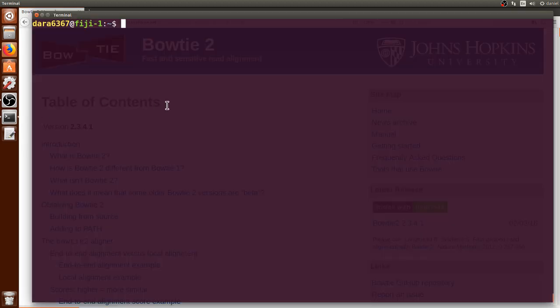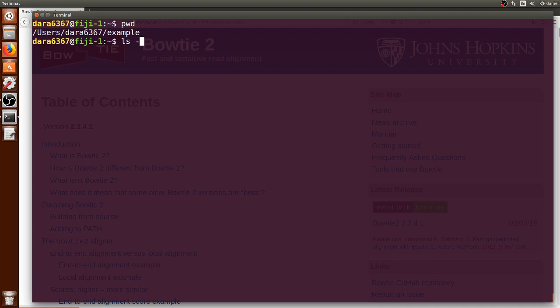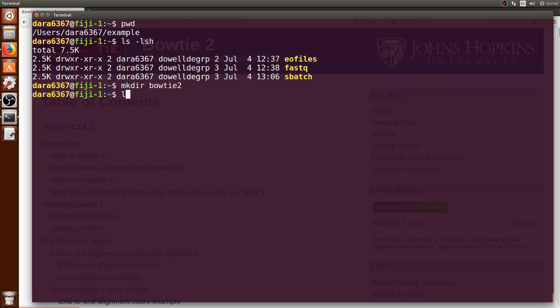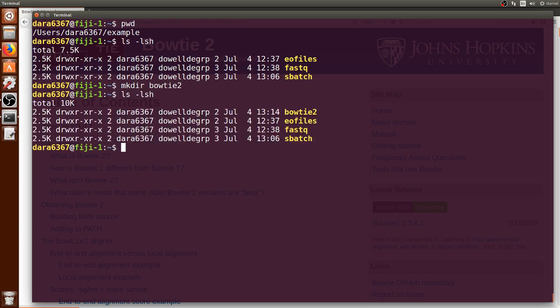So let's open a terminal here. We can print the working directory and list its contents. There are three directories here and I want to make a new directory called Bowtie2 where the output files will be stored. We can see that it was created here.